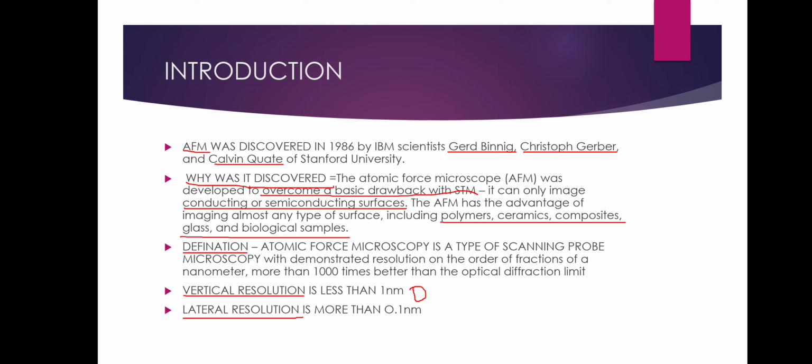When we measure the lateral resolution, we are measuring the horizontal resolution of the object. In other terms, lateral resolution is about the clarity of the image.